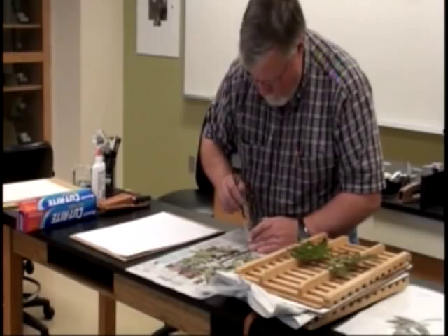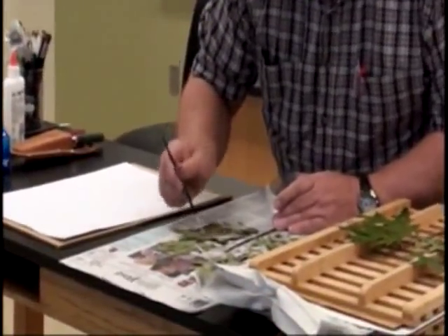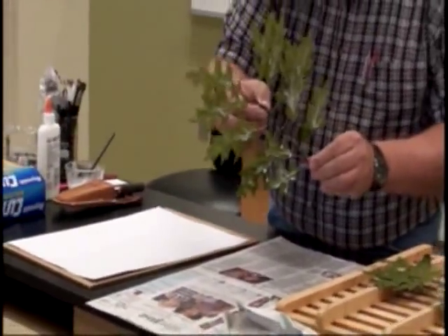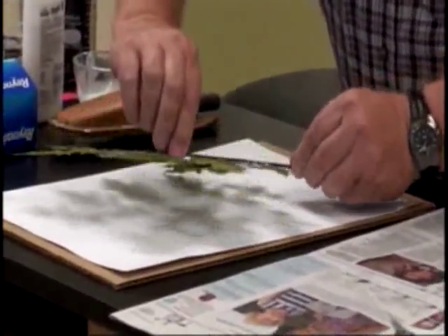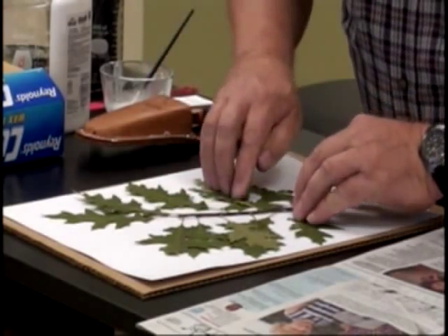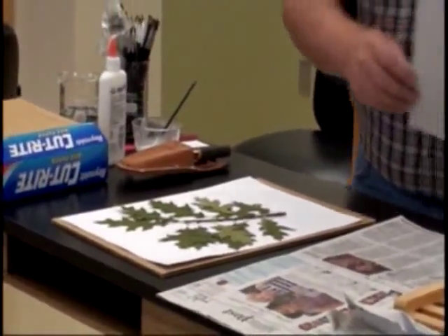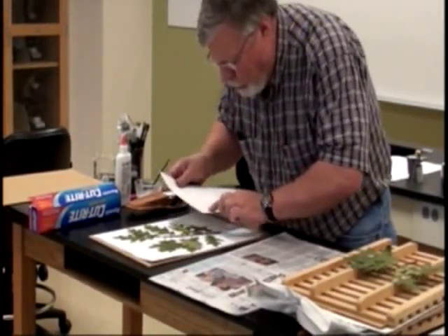Try to get some glue on the stems and the petioles. Now try to orient the plant kind of like you had it when you did a dry run, and place it on the sheet. Remember, always leave room down here in the lower right-hand corner for the label. If you do get a little bit of glue on the outside, take a piece of absorbent blotter paper and just blot the glue up a little bit so that it comes off the leaf.